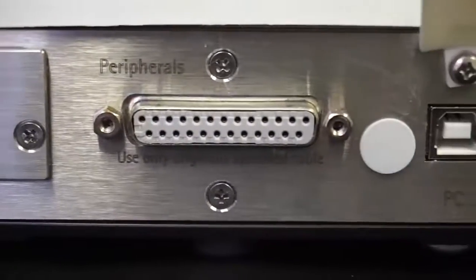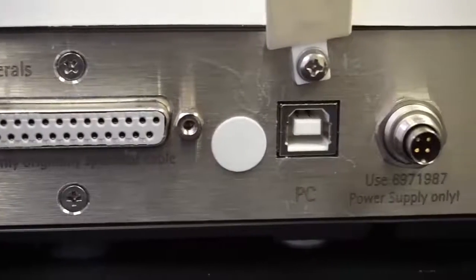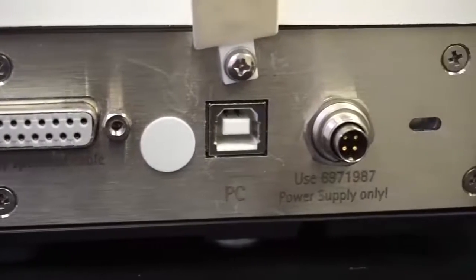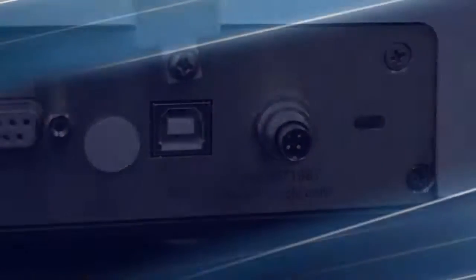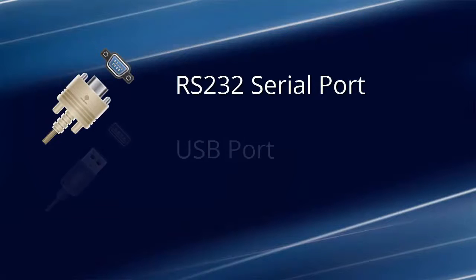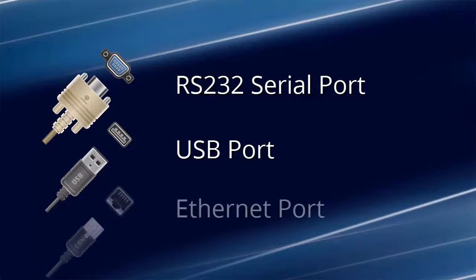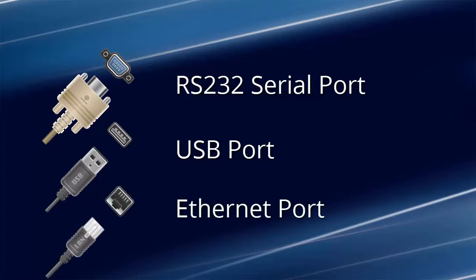First, let's check out the available ports in your balance. The connectors are most likely on the back. Typically, your balance will either have an RS-232 port, a USB port, or both.